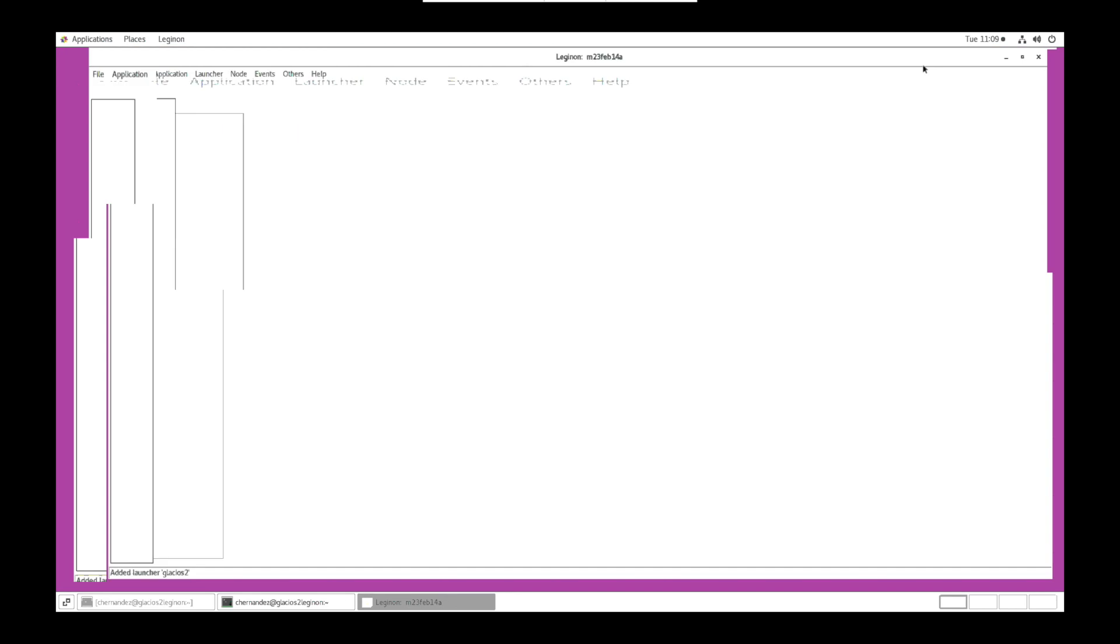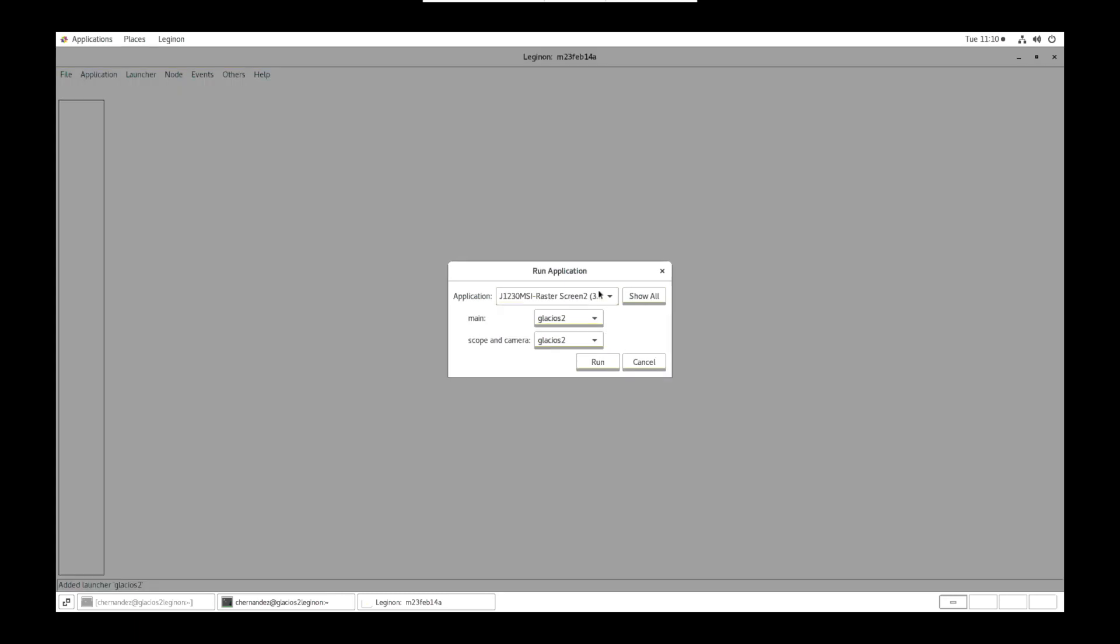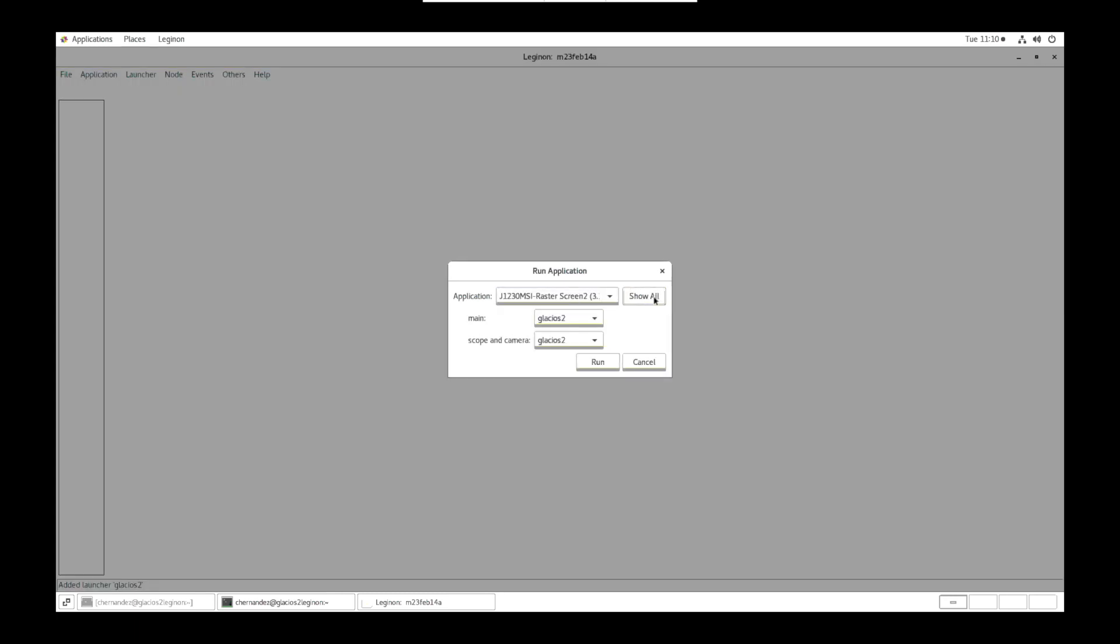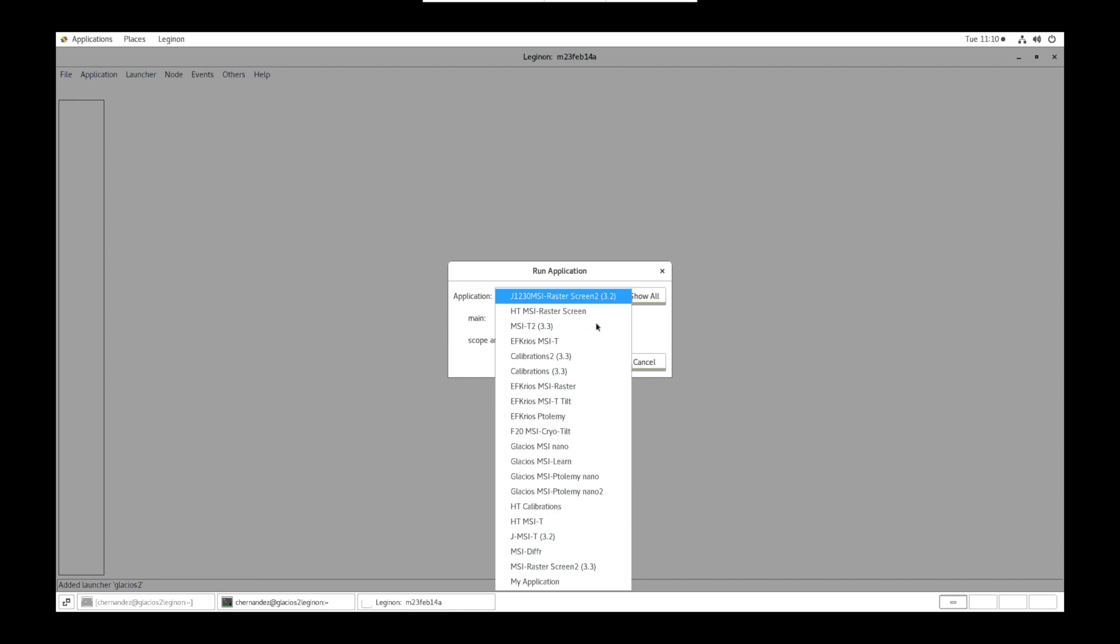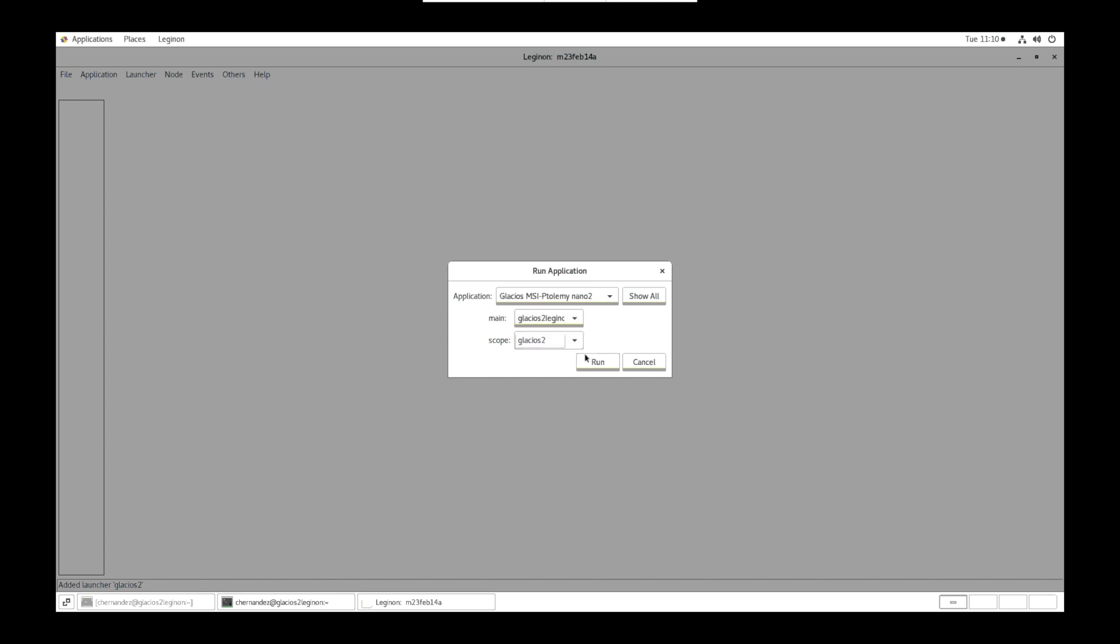Now that Legenon is open, we can then go to application, Run. Select show all to see all available applications. We are going to use Ptolemy Nano 2. Then set main to Legenon option and scope will be the name of the respective scope. Then click run.